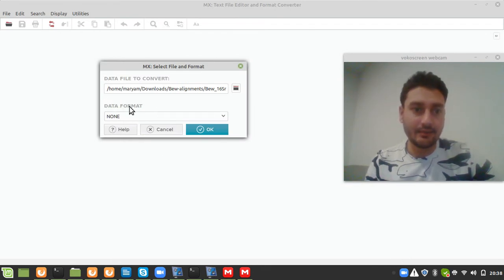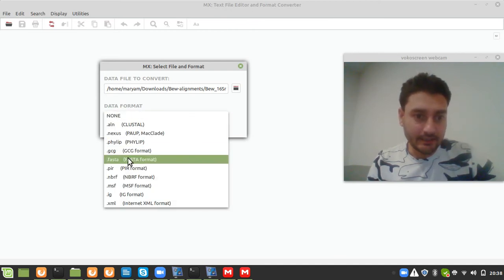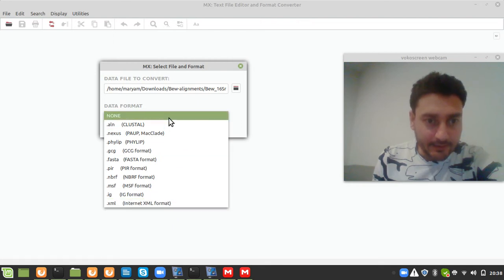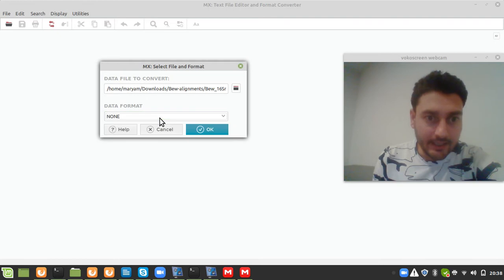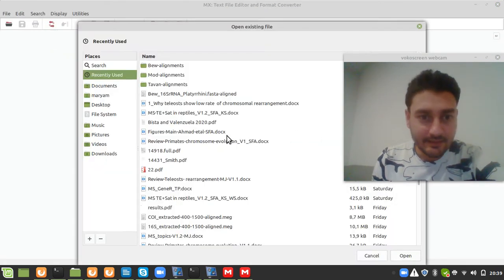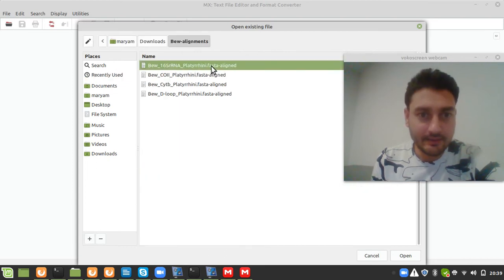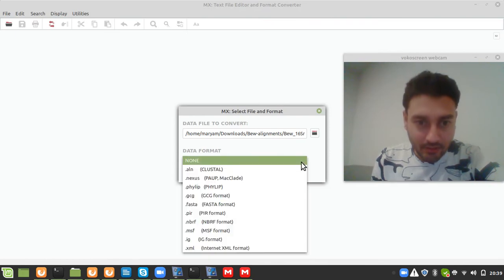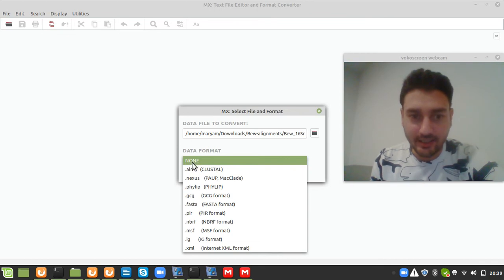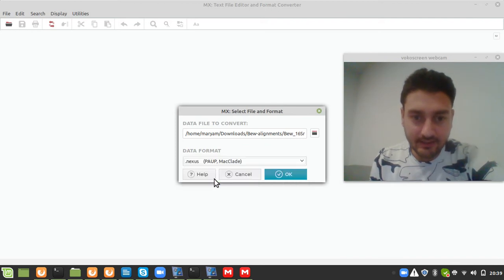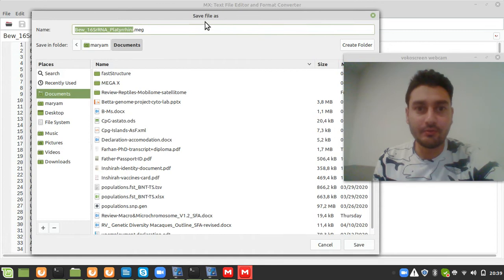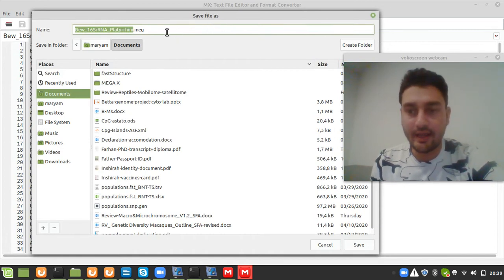When you open the file you will see the data format. Make sure you select 'Nexus' as the format — do not leave it as 'None' because that will cause a file error. Select Nexus, proceed, click OK, and your nexus file will already be converted to the MEGA format.